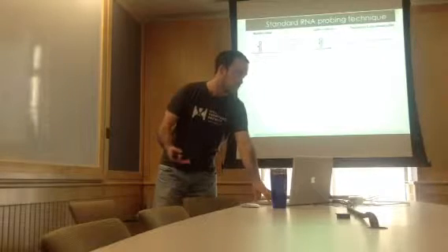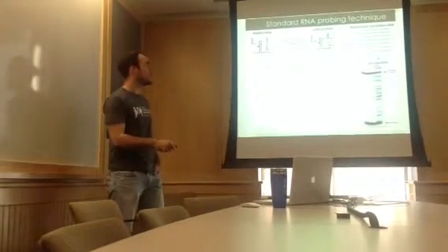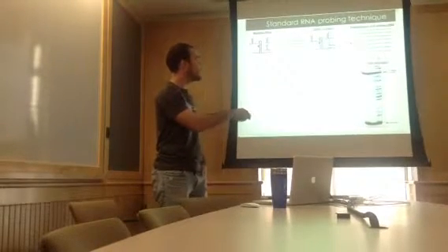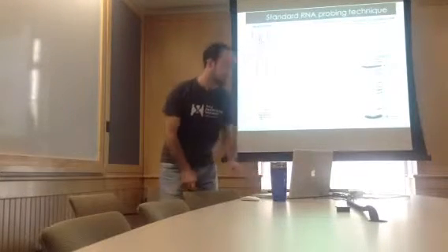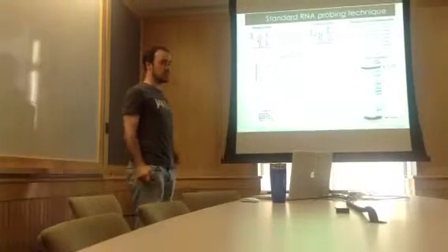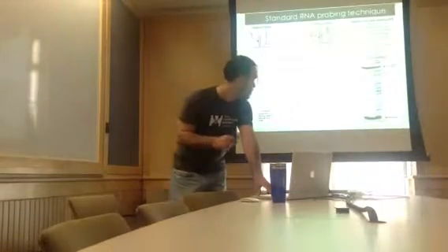But because we have more than one molecule in solution that will be modified at different places, we have an array of cDNAs, and when we separate them on a PAGE denaturing gel, we can see this kind of pattern where we are able to map where the RT stopped with the sequencing lane here and quantify the level of modification by looking at the intensity of the bands, and with that we are able to normalize and do some bar plot analysis, or to look at how our data fits a predicted secondary structure model, or even to use our data to generate a more reliable predicted secondary structure.